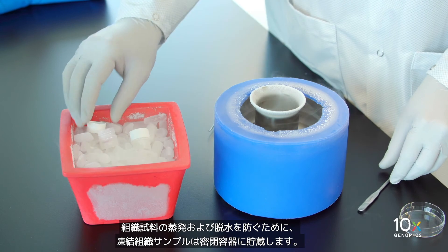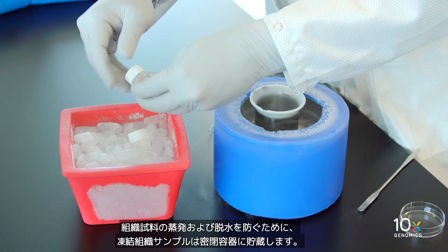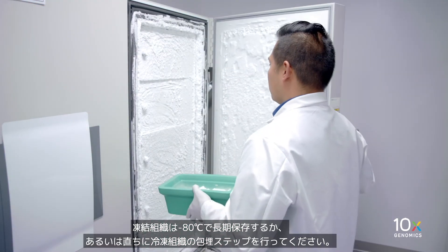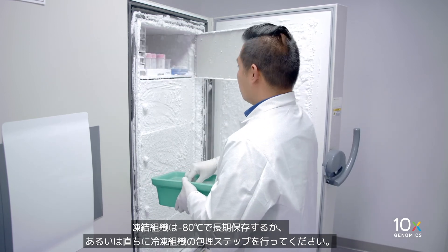To prevent evaporation and dehydration of the tissue sample, the snap-frozen tissue must be stored in a sealed container. Store frozen tissue at minus 80 degrees Celsius for long-term storage, or immediately proceed to frozen tissue embedding.